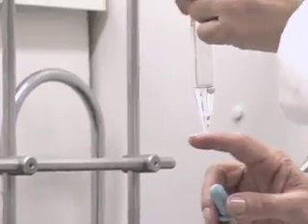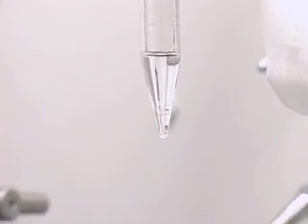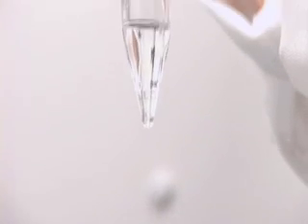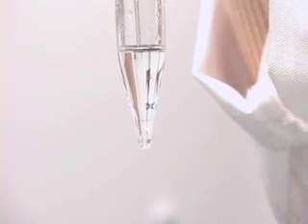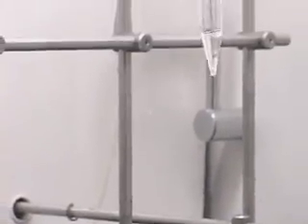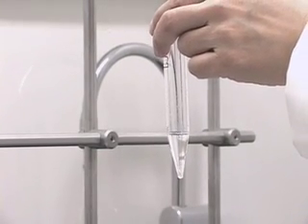There is still a drop that I see of the aqueous layer, so I am just going to very gently squeeze the bulb. And now I have taken out all of the aqueous layer from this mixture.